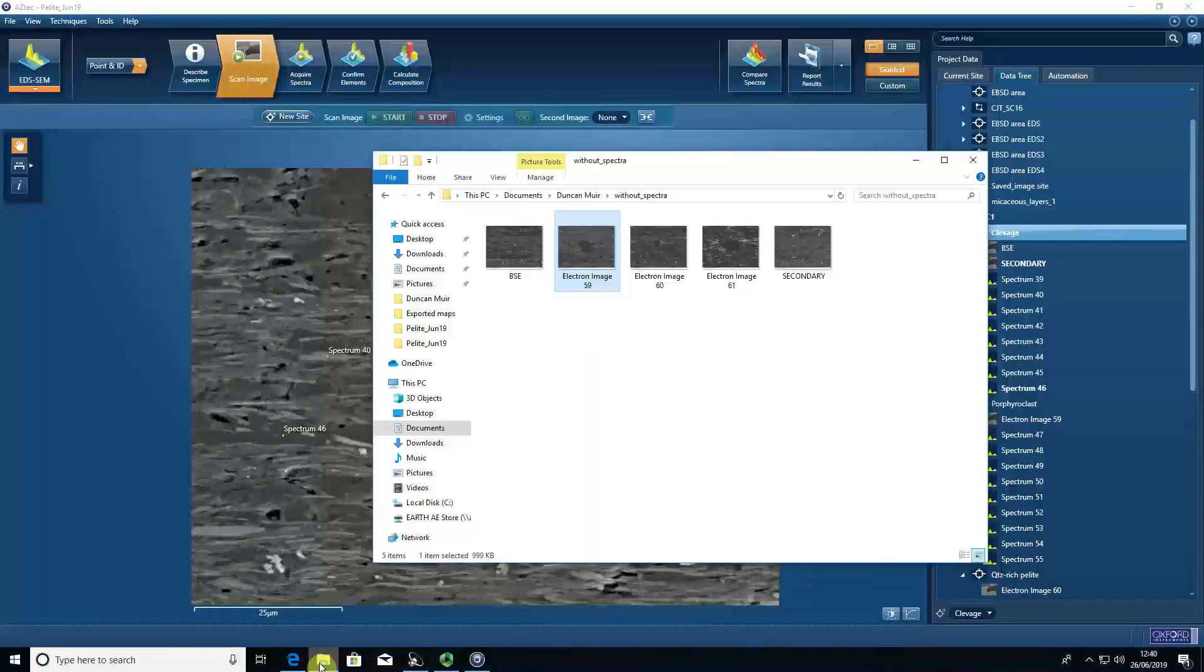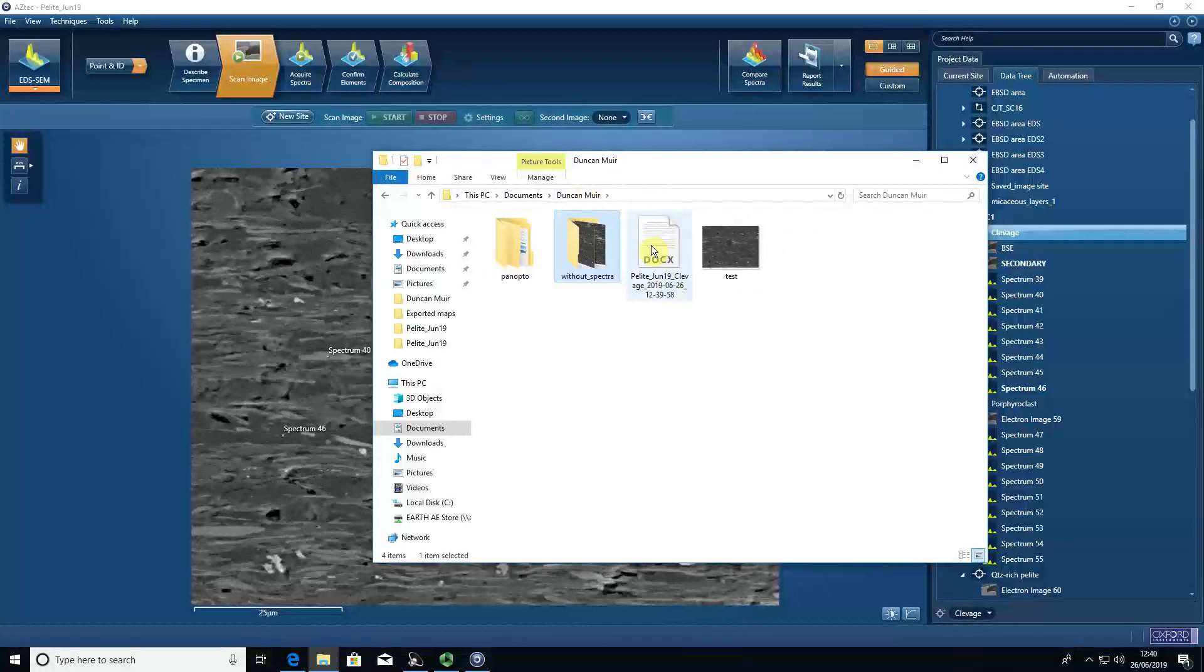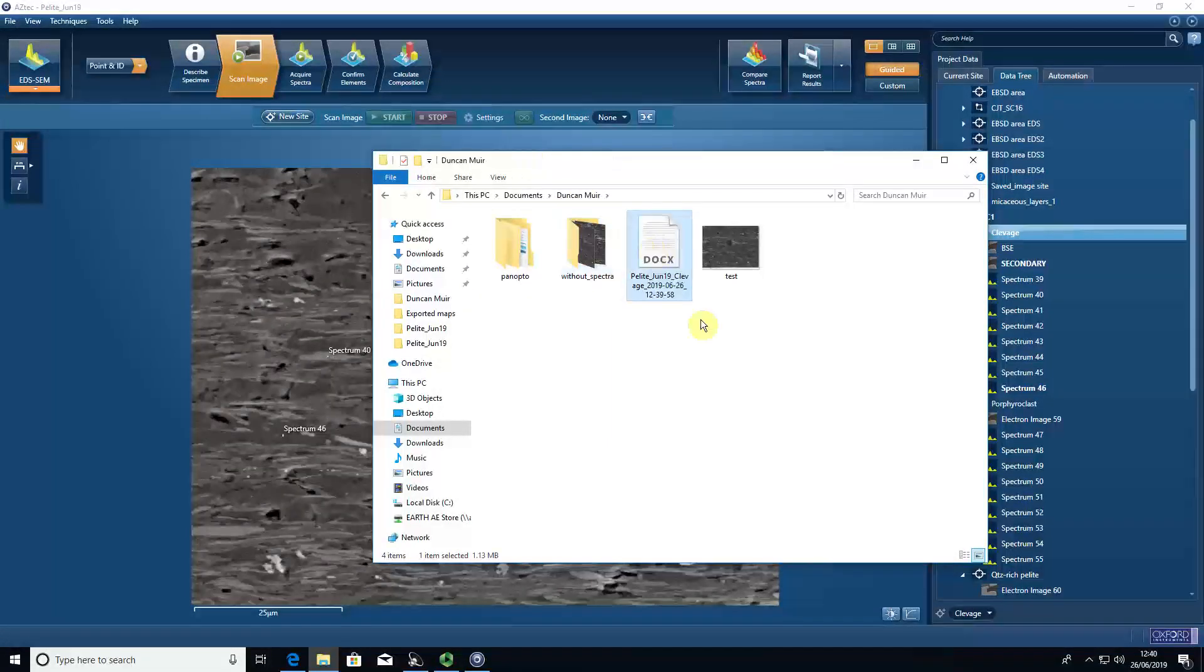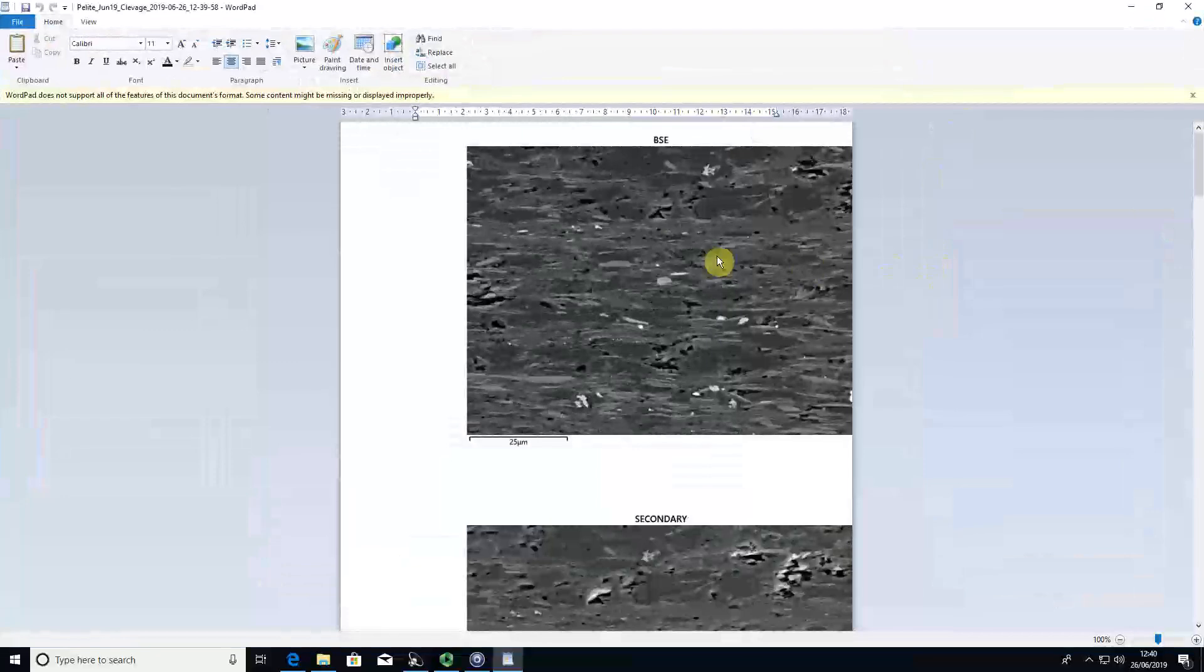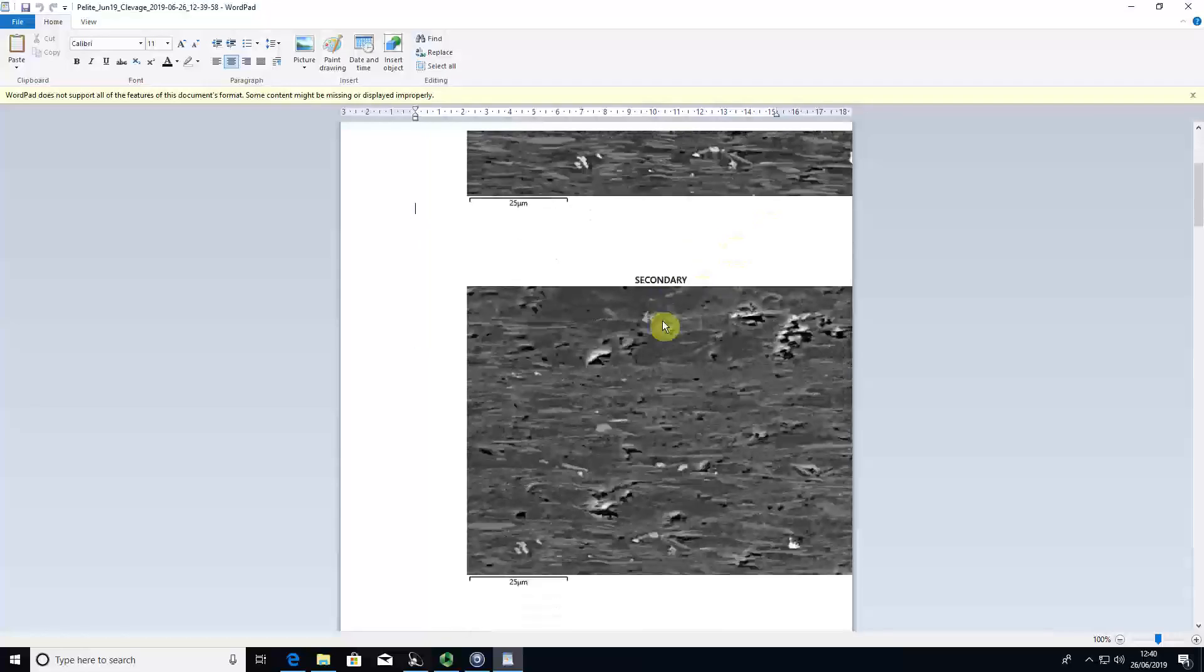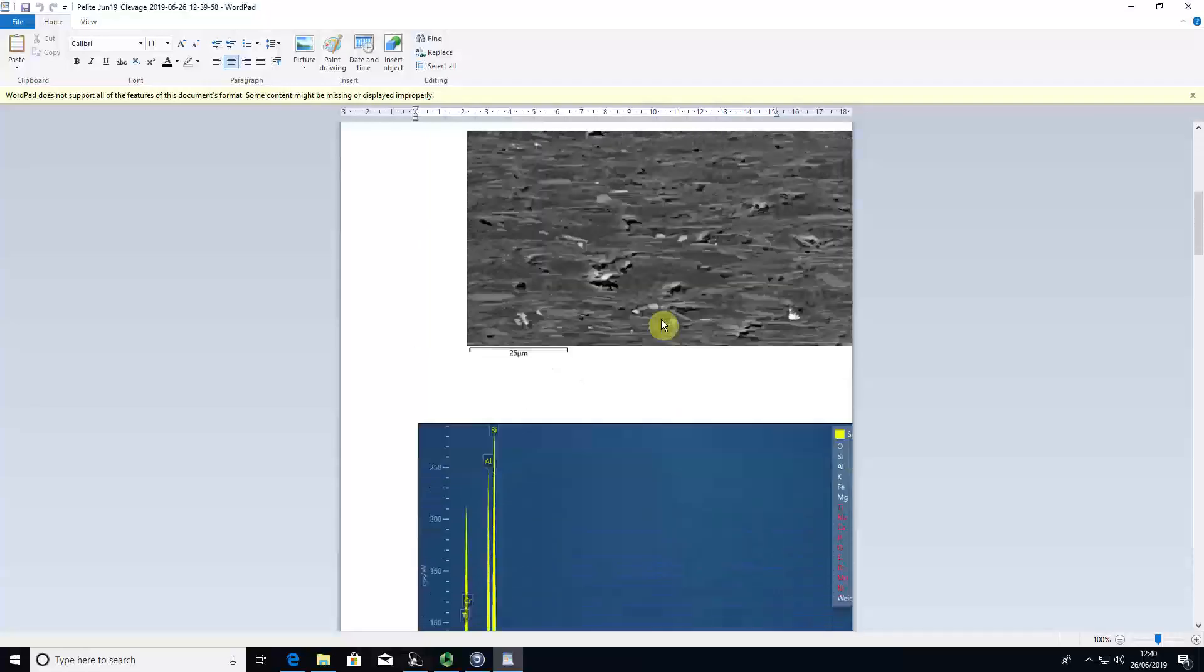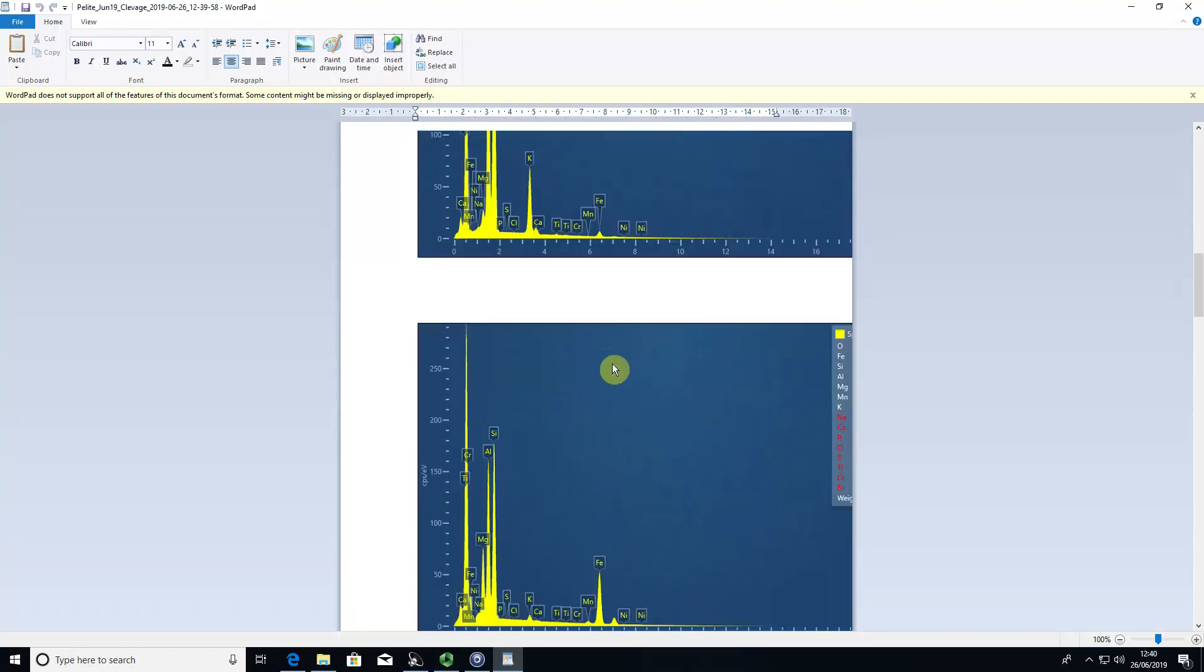Go to Windows Explorer, into that folder, we get a Word document. We can open it up, and you can see in this case we get the backscatter image, the secondary electron image, and what the spectrum actually looks like.